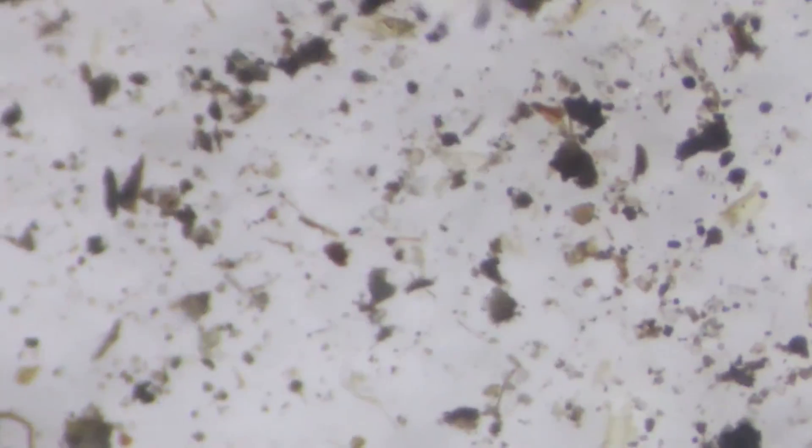Relatively low magnification. Can you see any critters? We may not be able to see them at 40x. I see a weird fluffy thing — I think that's just a piece of debris. It would be a lot easier to see stuff in this. How about one million x? I don't know of anything that will let us do a million x — maybe an electron scanning microscope, but you can't really look at live stuff on an electron scanning microscope. This is probably like 35x.